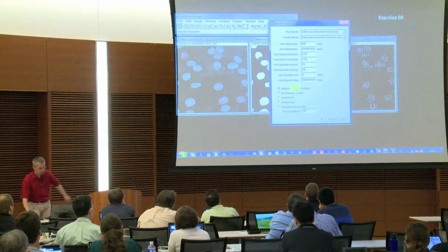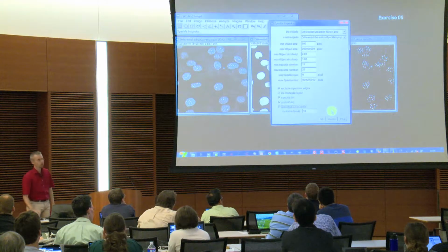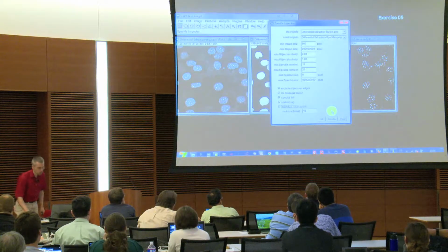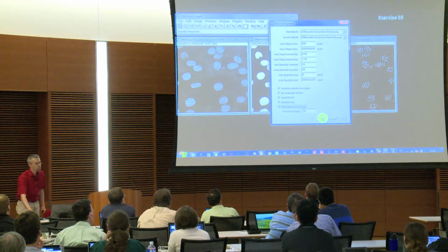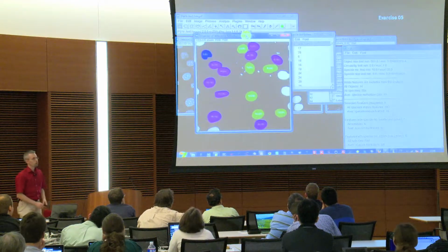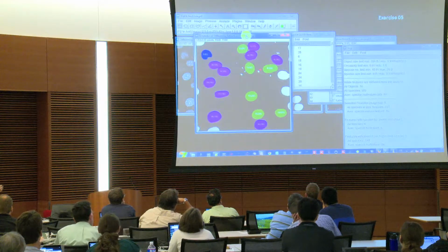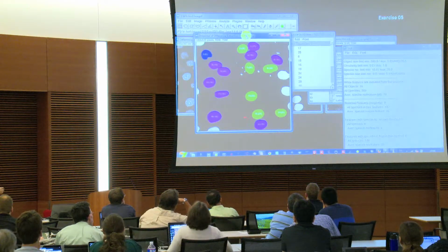So we again exclude the edges, and then we simply activate all four options here so that you see the maximum outcome you can get. If you now press OK, you get 4 or 5 different things. First of all, the color-coded map, like before. White is excluded. The magenta were the ones which were analyzed inside the parameters.